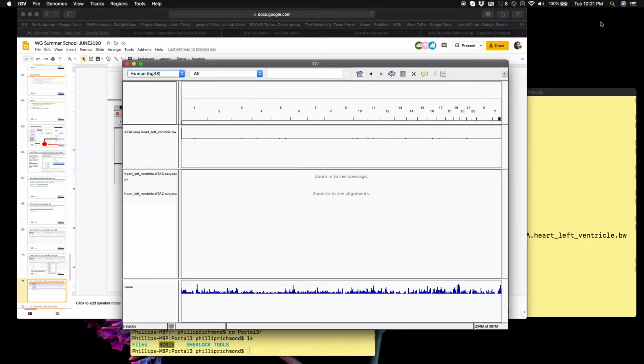It may or may not be 10 p.m. the night before I teach. Hooray, grad school. Okay, so now we have our files loaded.